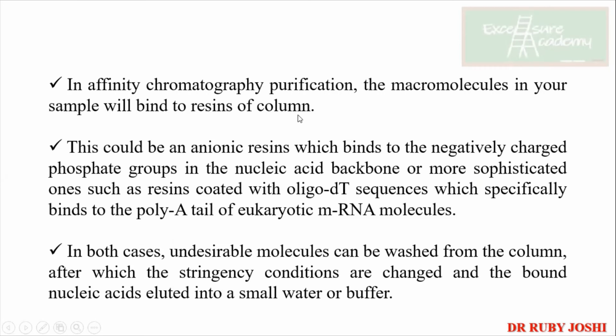Affinity means they are going to be specific. This could be your anionic resins which bind to the negatively charged phosphate groups. When you say anionic resins, what does it mean? It means the matrix is having the positive charge, okay? Or you can also have resins which are coated with oligo dT sequences.